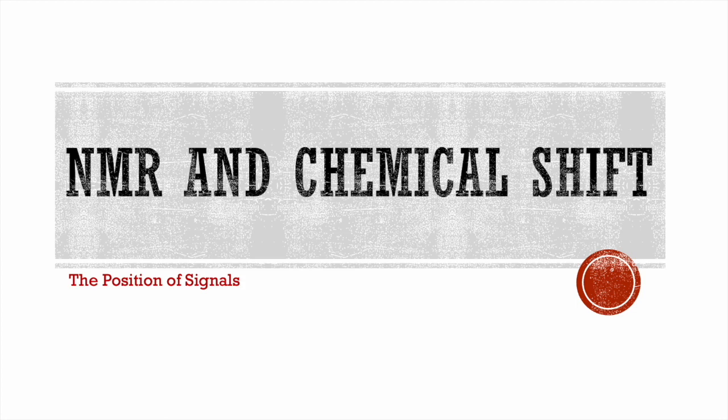So today we'll be learning something about the NMR spectroscopic technique, which stands for nuclear magnetic resonance. In nuclear magnetic resonance spectroscopy, we'll specifically talk about the chemical shift, wherein we'll discuss the position of signals in the spectrum.